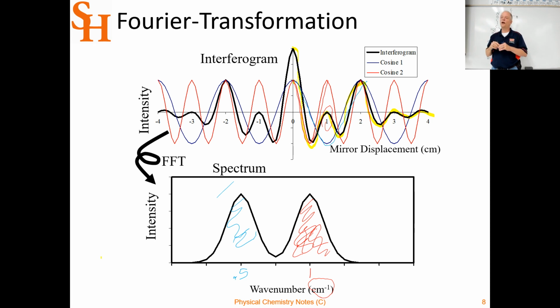And then that interference pattern, if you look at it closely, it matches when the red and the blue are in opposite phase, our signal is 0. Right? When the red and blue, like red is negative here and blue is 0, so it's at the smallest value. Here, when red and blue are both back up at their maximum value, then our interferogram is at its maximum value. Now there's also a function that's been applied to this interferogram called a triangle function.